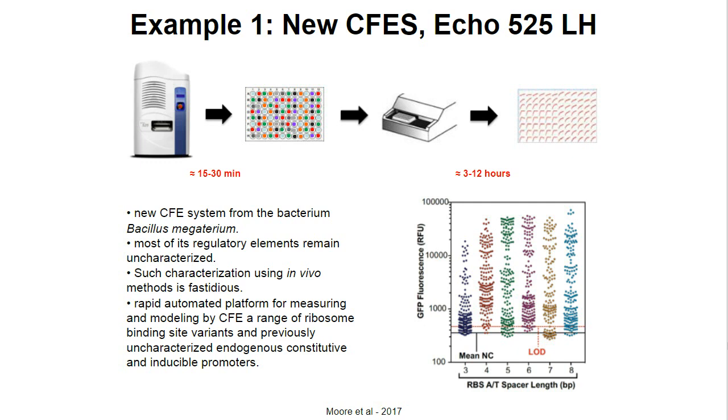And a colleague lab of ours, Paul Freemont's lab, they were interested in designing new cell-free systems. So can you make a cell-free system from a non-model organism? Because right now, cell-free systems, the most popular one that we use is based on E. coli, but there's also PURE, which is completely synthetic. But what about using other organisms?